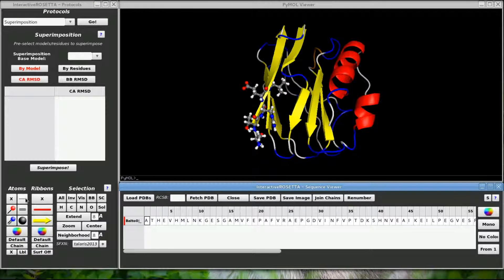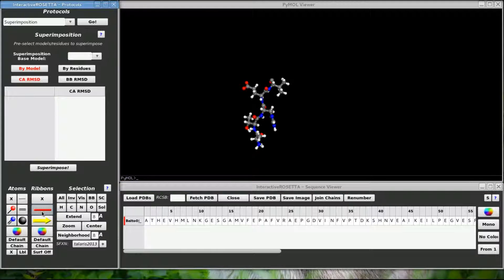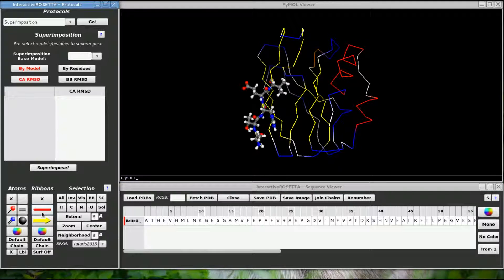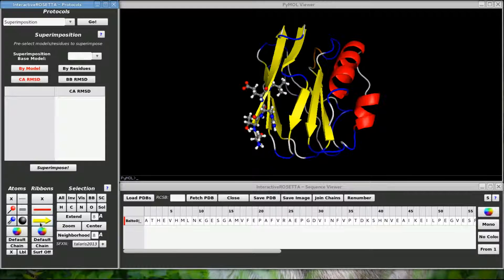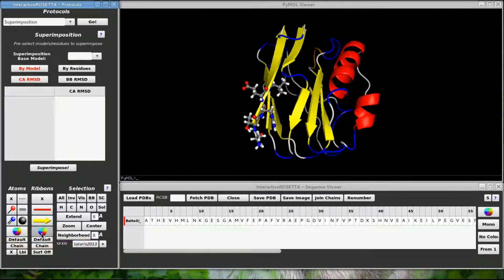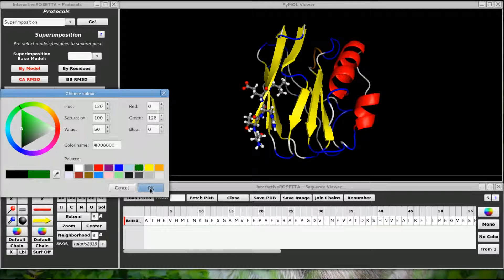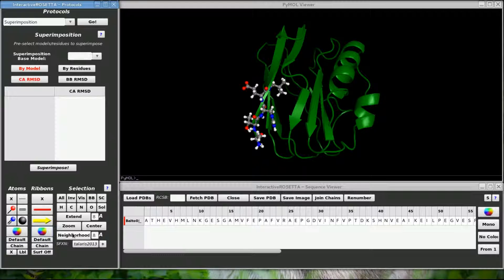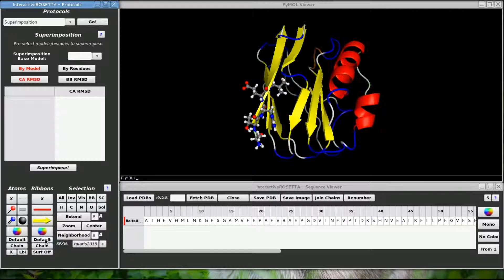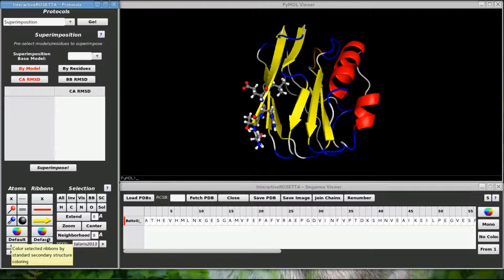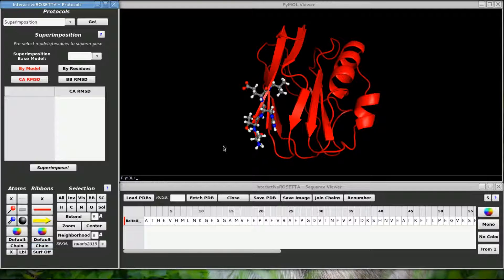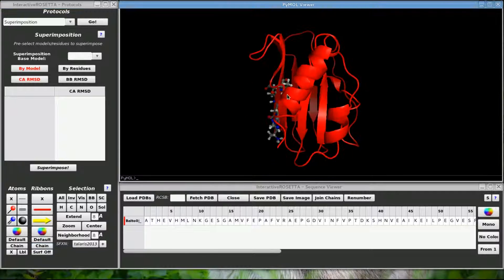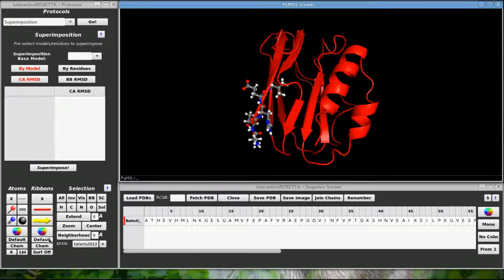These buttons over here control the ribbon rendering. This turns off all ribbons. This gives me a thin string view of the ribbons. And this gives me the usual cartoon display. This button allows me to recolor the ribbons. So let's color the ribbons green for now. This button reverts the coloring back to the default secondary structure coloring. This button here will color the ribbons according to the chains, which can be useful for easily distinguishing between multiple loaded chains.